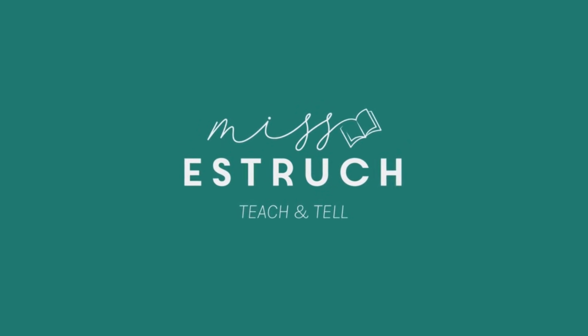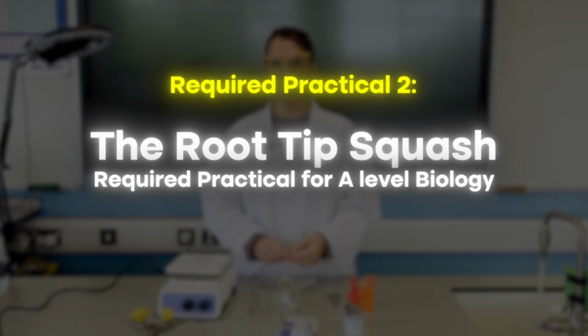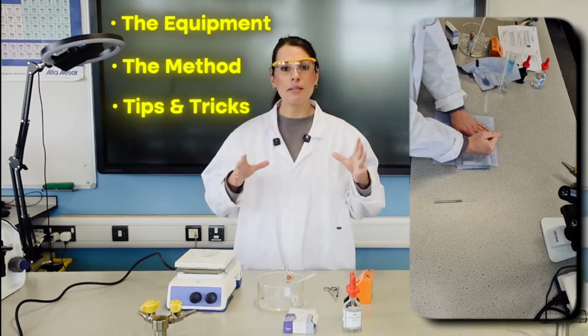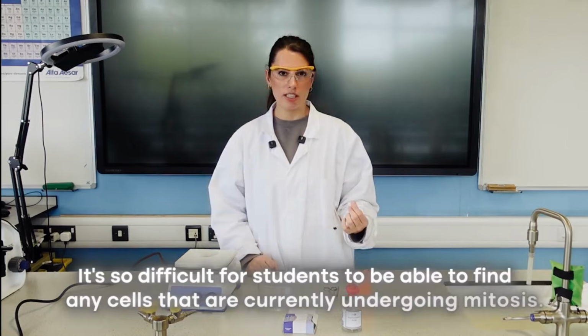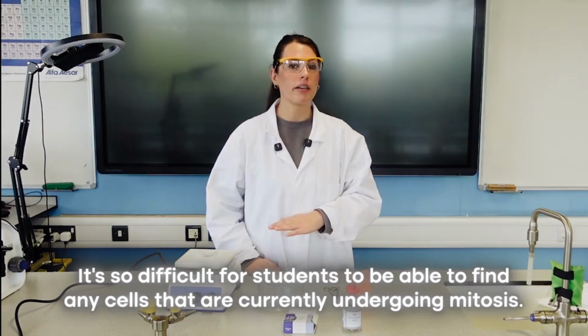In this video, I'm going to be going through the root tip squash required practical for A-Level Biology. We're going to be looking at the equipment, the method, and then tips and tricks to try and help make sure that it works. Because if you've ever done this before, you'll know notoriously it's so difficult for students to be able to find any cells that are currently undergoing mitosis.